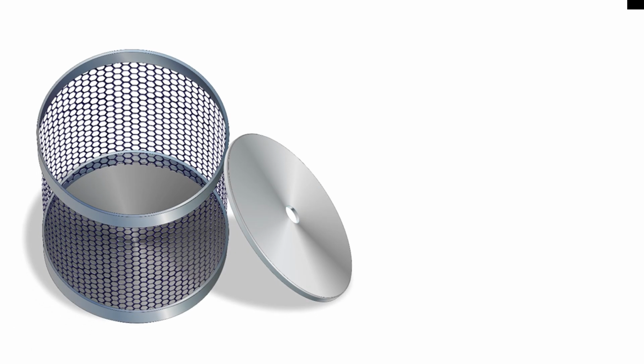The SPMD comes shipped from the commercial vendor as intact samplers, with the triolein film sealed in the LDPE tube and the requested performance reference compound, or PRC, added by the vendor. The type of PRC is dependent on the chemicals of interest for the project.